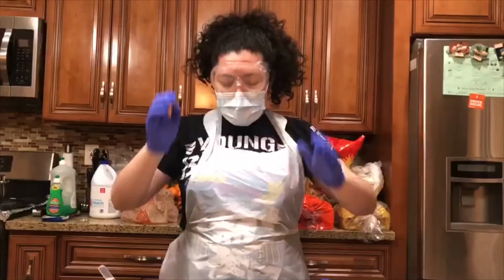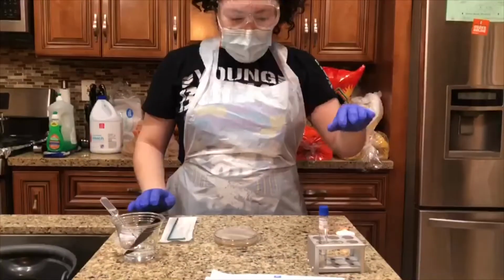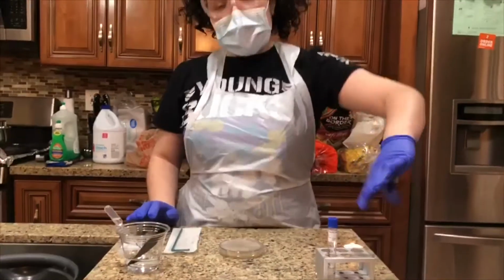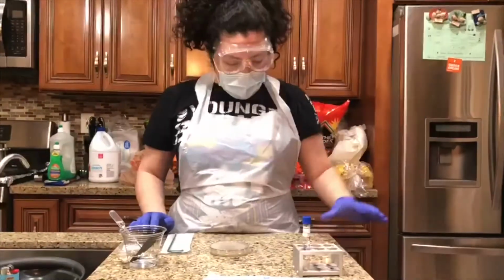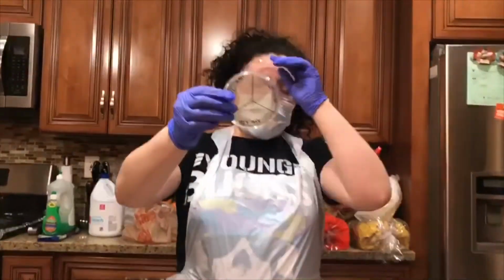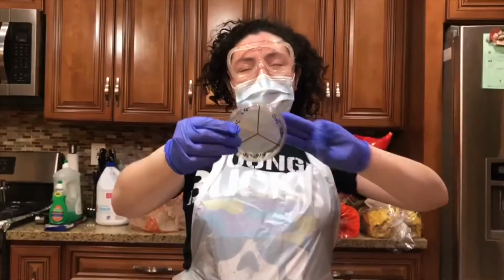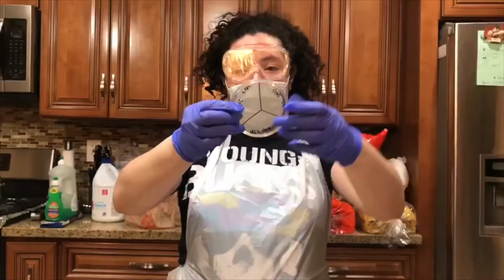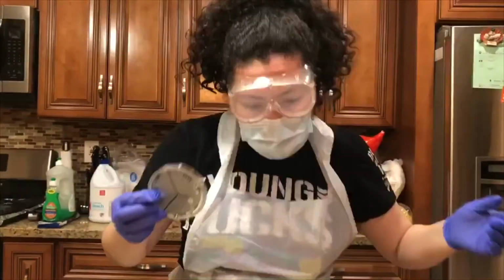So I already cleaned my site with 10% bleach, and I have everything set up. I have my active culture, which is the S. epidermidis right here. And then I have my candle. I have my agar plate, and I already evenly divided the agar plate into three antibiotics that I will be testing, which is the penicillin, the gentamicin, and then the novobiocin.